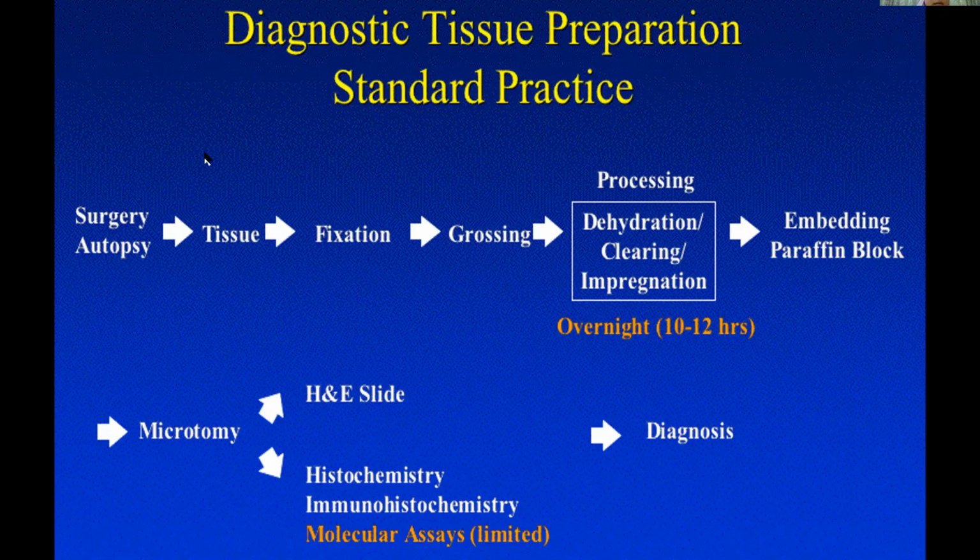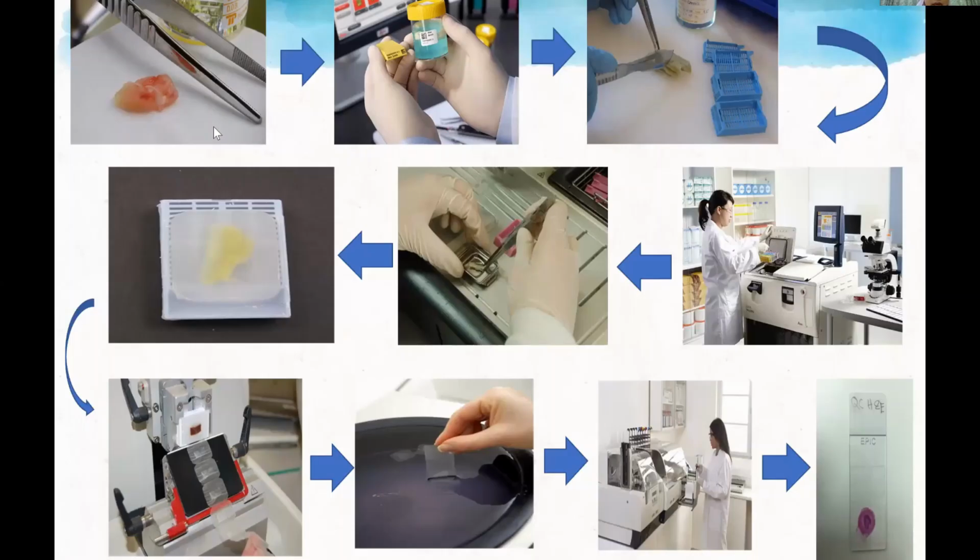So this is similar to what I mentioned to you. You can see this is the specimen that we get, and then we need to put it immediately into the formalin. After that, what we do here is grossing examination. We examine the specimen, we take sections, and then this is a processing machine. This is the embedding, meaning we put the tissue from just now into a mold.